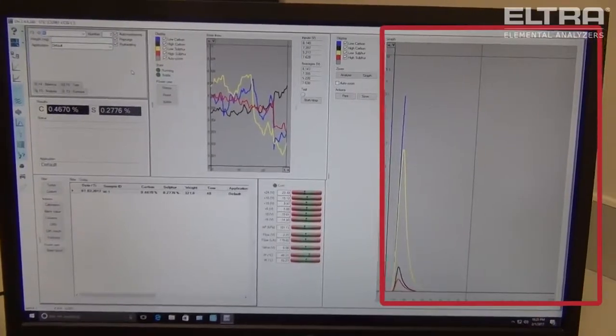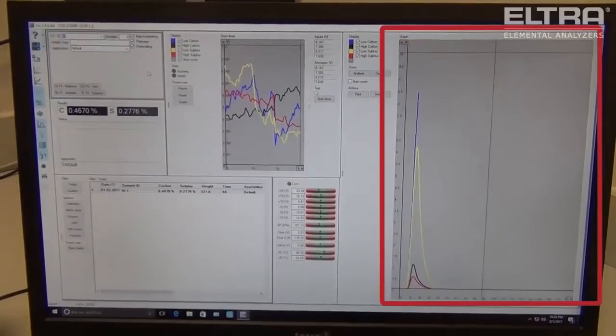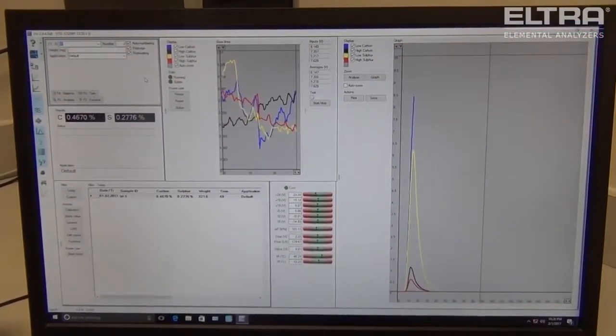For the sulfur, we have the low sulfur channel, which is in yellow, and the high sulfur channel, which is in red. The sample is now done analyzing.